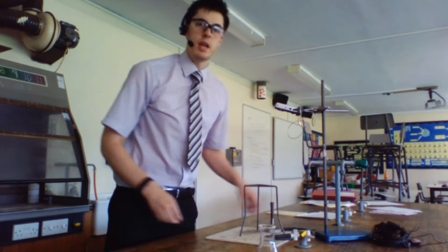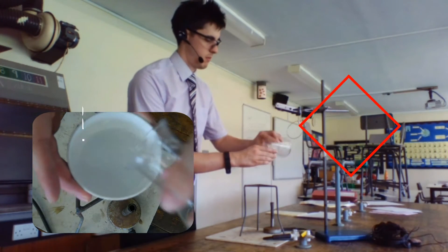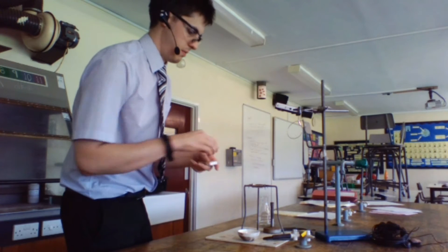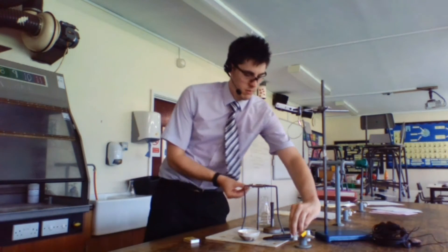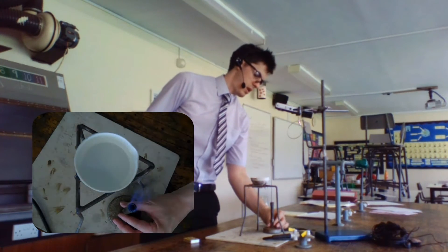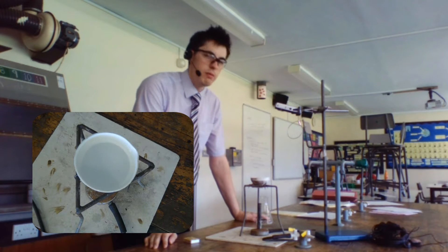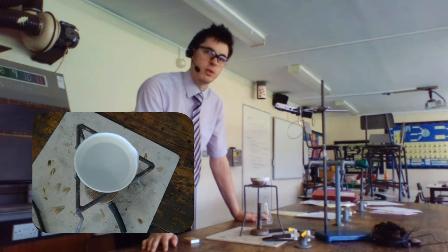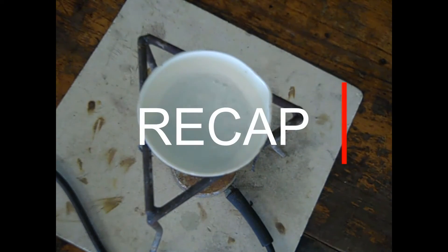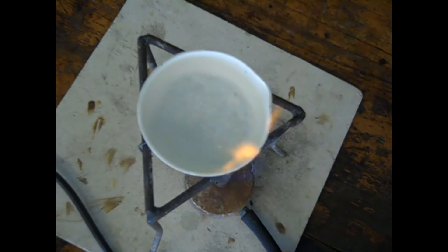The next step is to evaporate the solution. Tip it into an evaporating basin, then place a clay triangle on your tripod and light your Bunsen burner. Place the evaporating basin on top and begin to heat strongly. Continue until it starts to evaporate, then keep removing the Bunsen burner to prevent any salt spitting — you want to get as much of the salt as possible. We're evaporating the water to leave us with our salt, and by not using an indicator we're making sure it's pure.